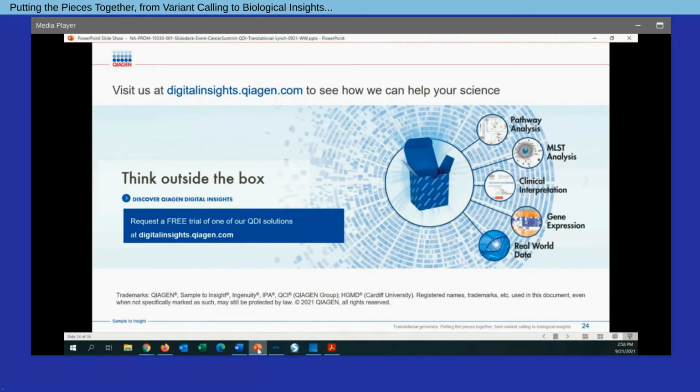In the context of at least CLC Genomics Workbench, it definitely has the flexibility to at least call and look at, let's say, amino acid changes in microbial variants in that context. So for the interpretation aspect, again, primarily focused on human hereditary and somatic diseases. Got it.